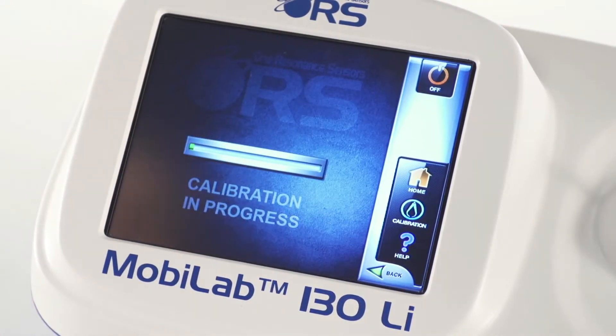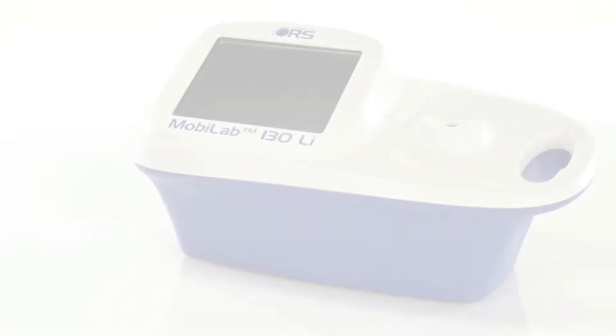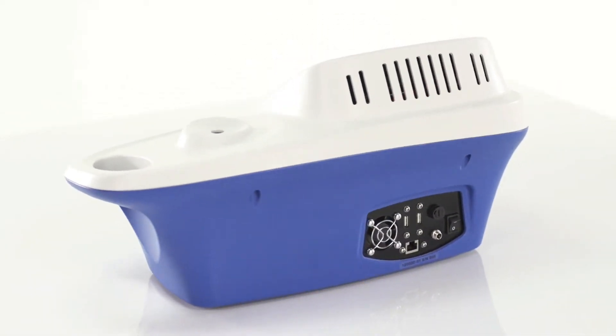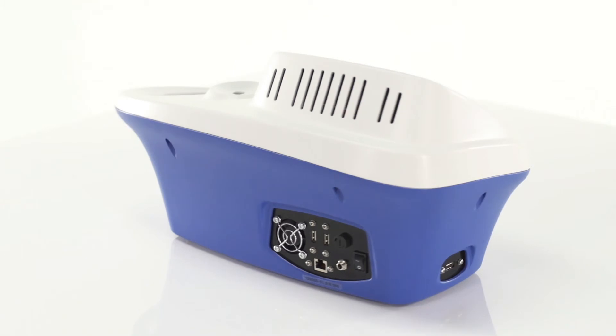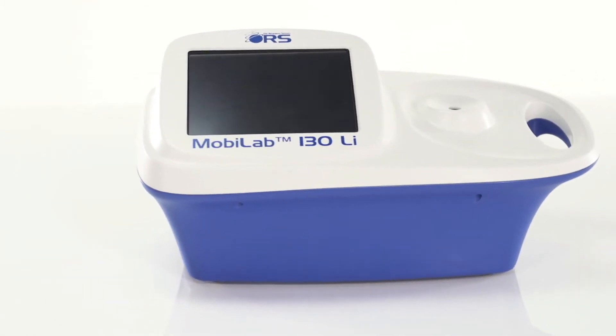Press OK. In less than one minute, the MobileLab 130 will indicate that it is ready to conduct the chemical analysis. The MobileLab 130 provides reliable analysis in a wide range of environments. The instrument can be operated with batteries or inside a vehicle and may be adapted for online measurements.